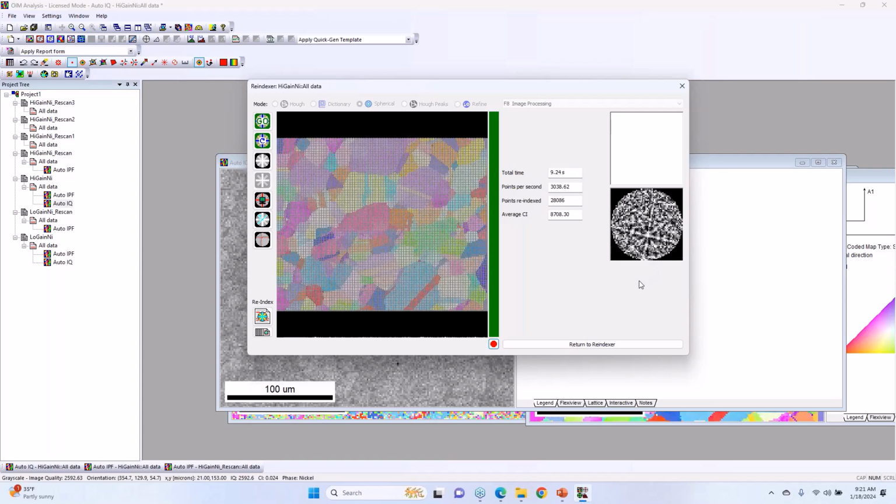But the other thing is, what kind of hard drive is it stored on? I often carry around my little solid state drive to carry data from the lab back home, and I'll just rerun it from there. But I can see that when it's talking to that drive, it's slower than if I copy things over to my faster hard drive on my computer directly. So if you're trying to maximize your throughput, I'd recommend getting it stored on the hard drive with the fastest access time, and it's going to process faster.